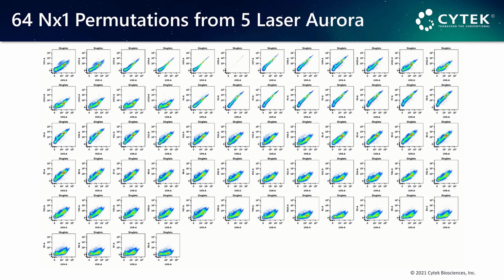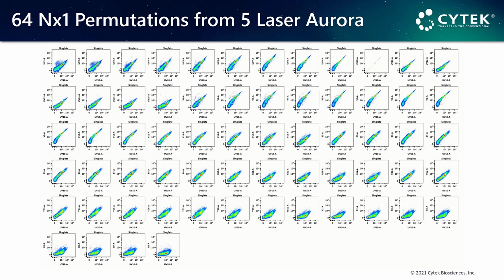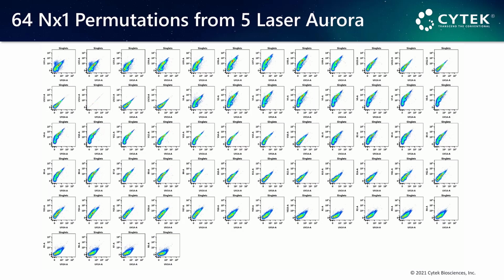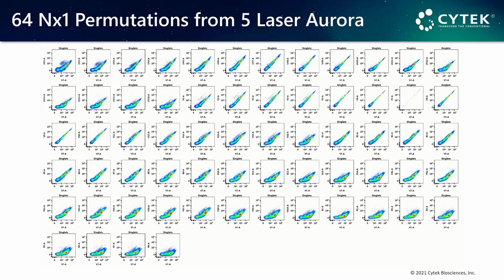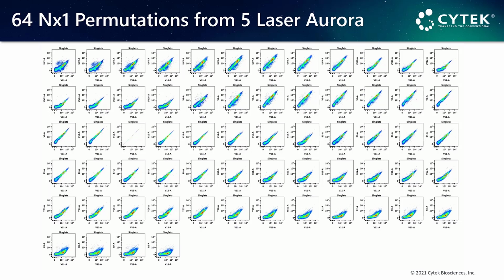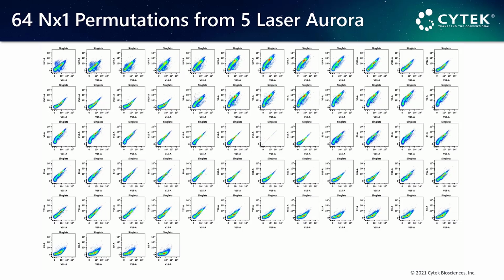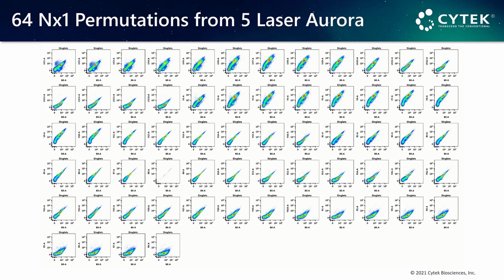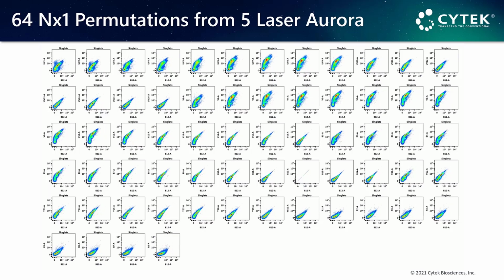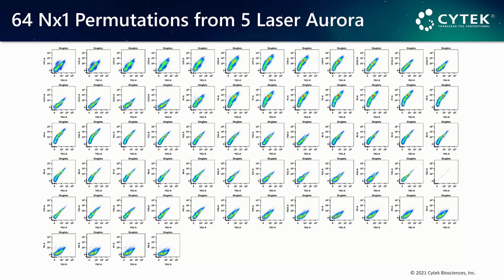So pay particular attention to that top row where we see the UV detectors from ultraviolet 1 to ultraviolet 12. The ultraviolet detectors are often the most informative when we're trying to find distinctive population clusters, and this sample is absolutely no exception. Notice how little differentiation is observed in comparison through those latter detectors in each laser module.